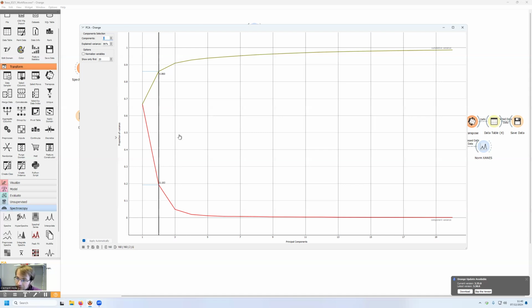What you want to do generally is to select only the principal components that explain a lot of your variance, because a component that explains only 1% of your variance is generally just focusing on the noise and is not very significant. So here, typically, we can work easily with 3 components.